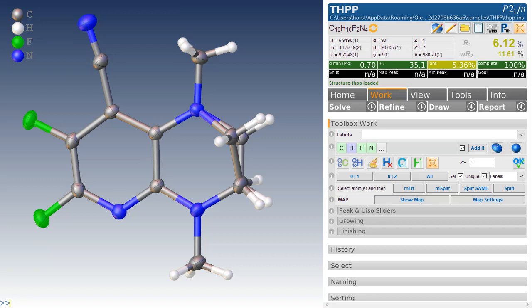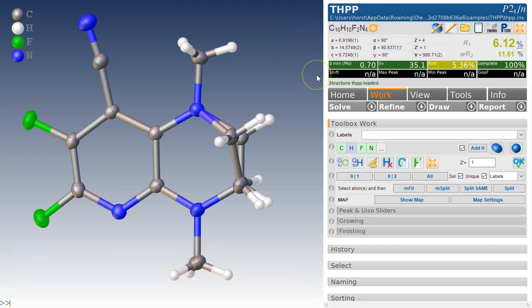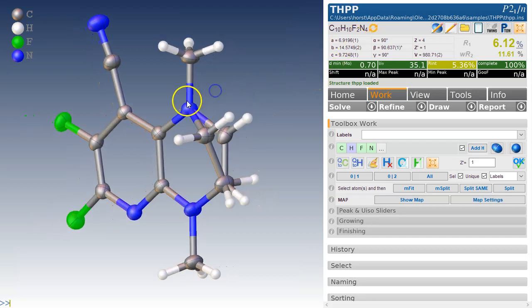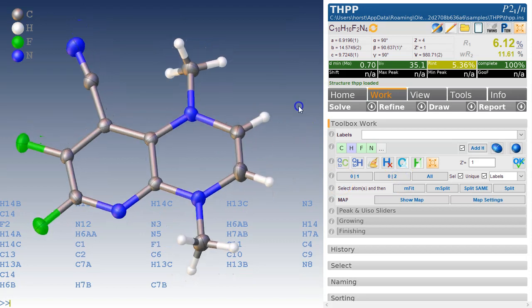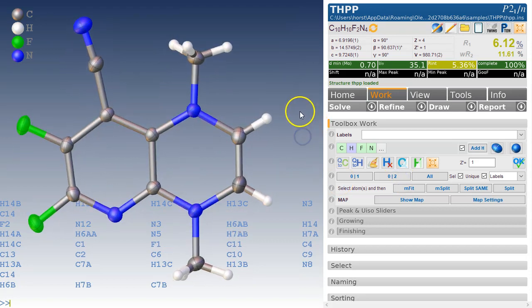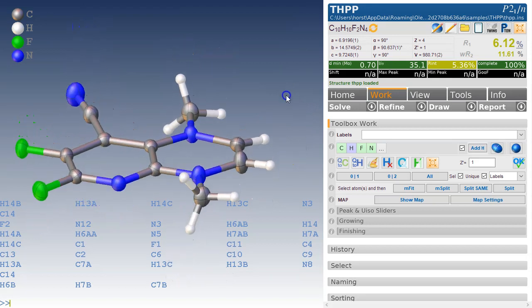Today we will look into disorder modeling in OLEX2 using the THPP example that we've used many times in the past. This is how it is currently shipped in OLEX2 with a very strange disorder of part 0 and part 1 being this one here, and part 0 and part 2 being a different chemical compound. Now the question is, is this actually correct? We will examine this in this video.